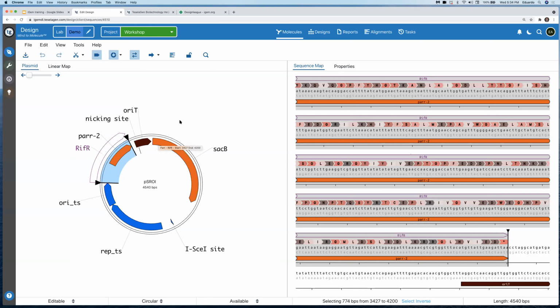Typically, people do it in the context of a more complex protocol, like a DNA assembly protocol, where part of the protocol might involve PCR amplifying some parts, but we have primer design tools that run in the backend of our platform, and it will when you run our algorithm, our J5 algorithm that I'll show you in a second.